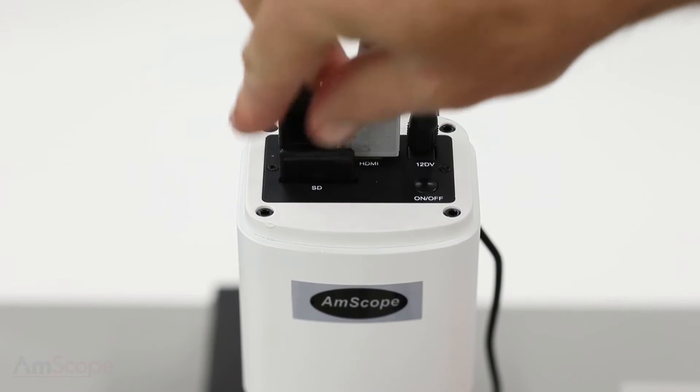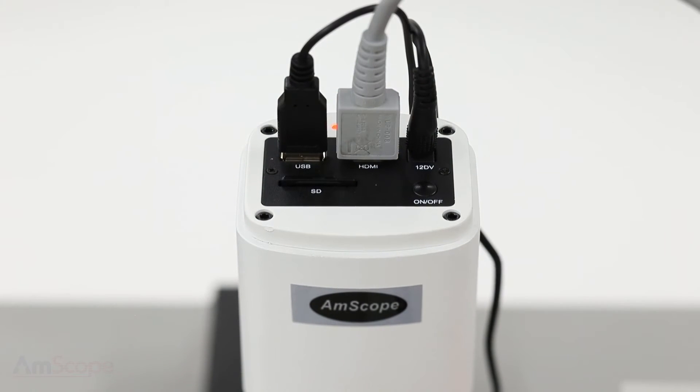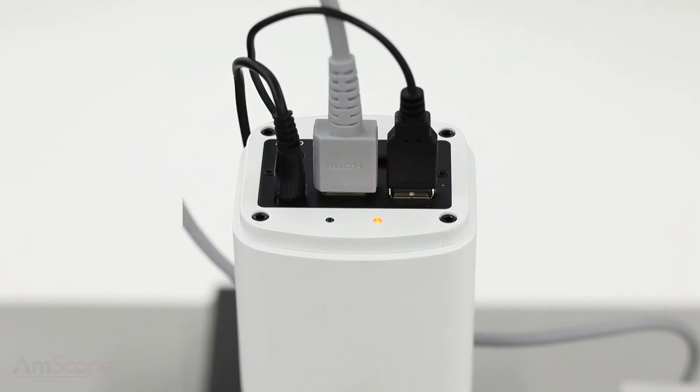I'll insert a secure digital card. This is where all the images and video will be stored. And now I'll press the power button. A blue LED will light up, indicating that the camera is on.